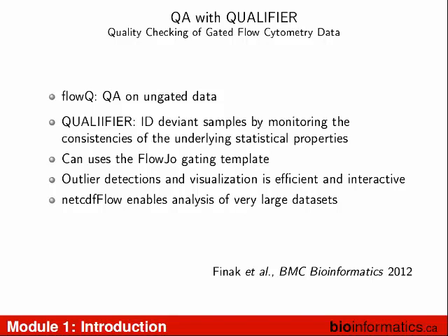As an example, there is no standard for gating that people have implemented, except that FlowJo is using it. Essentially there's no place that describes all this other stuff, other than the FCS file, in an open way that people are all using. So for us as software developers, it's a big pain to reverse engineer all these different tools that all these different software developers have built for all the different workspaces. Unless we had a reason to do that, because we had some study we were getting paid to do, we're not really interested in spending the time, because that's not very interesting. So no.